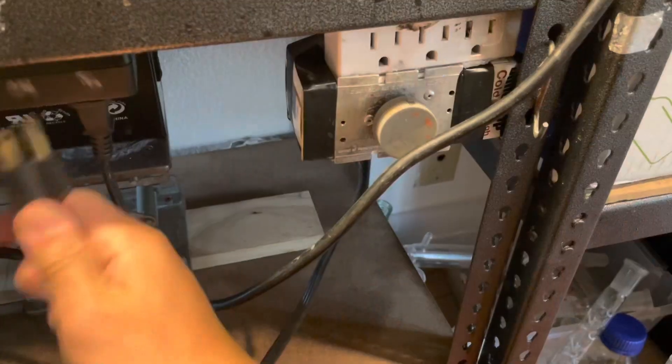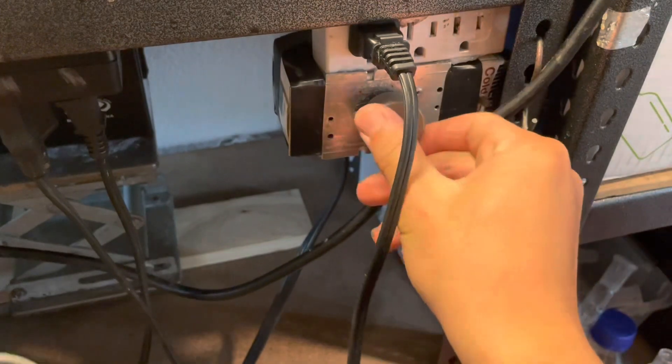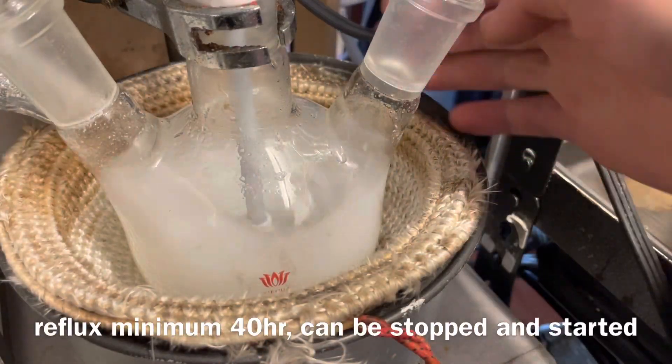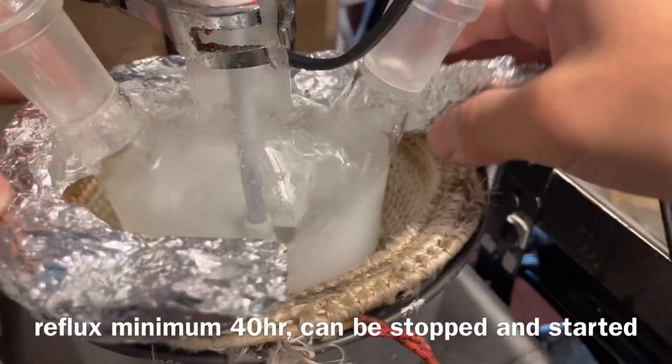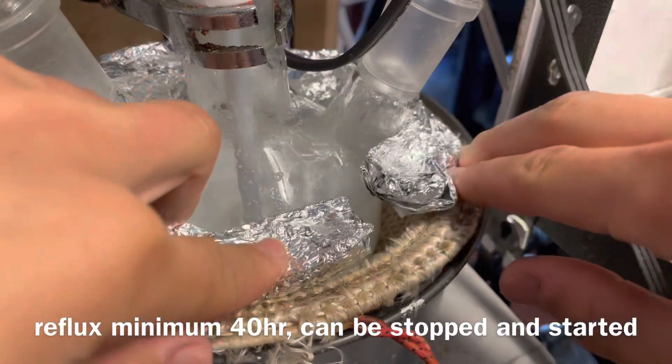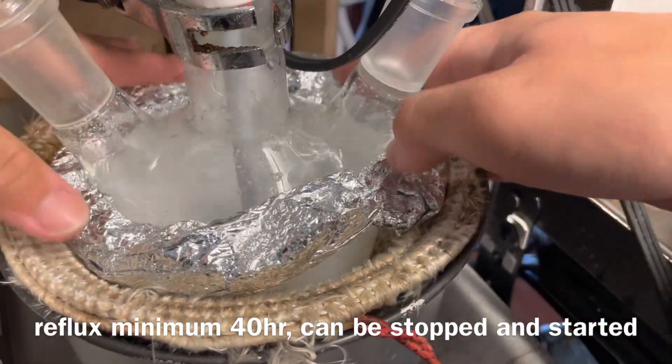Refluxing it faster does not mean it will go faster. So try to guess how many hours it took. 40 hours, spanned across a few weeks, because I can't leave this running 24-7. But 40 hours seems like the minimal amount it needs for all the nylon to be completely dissolved.